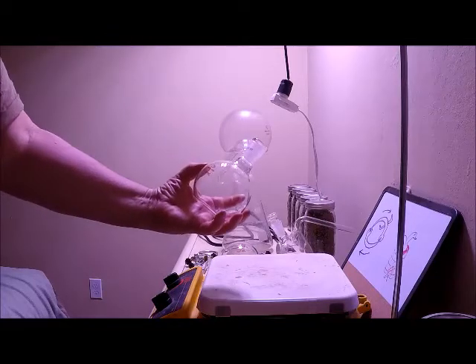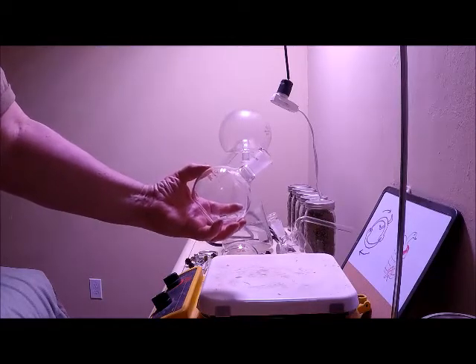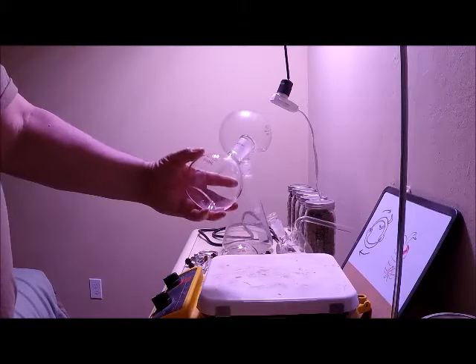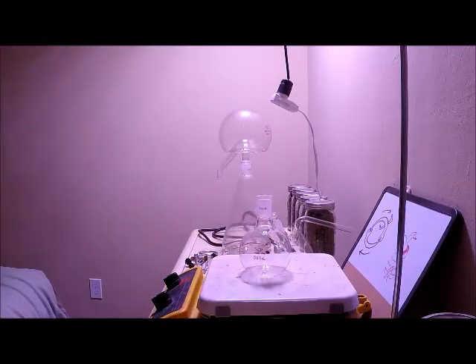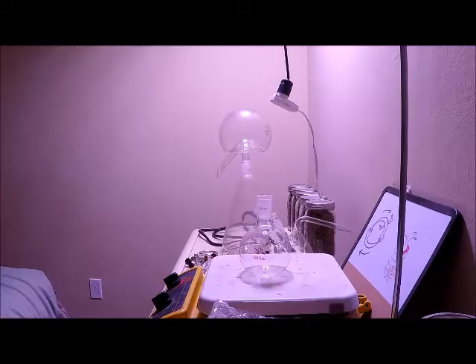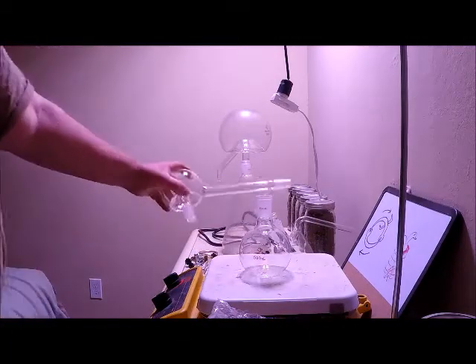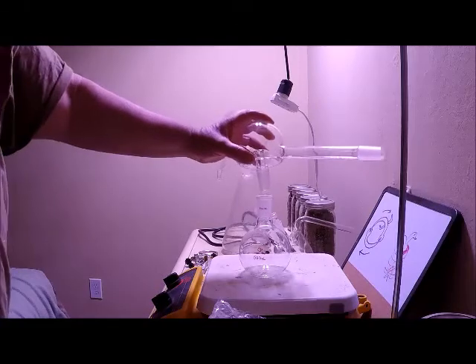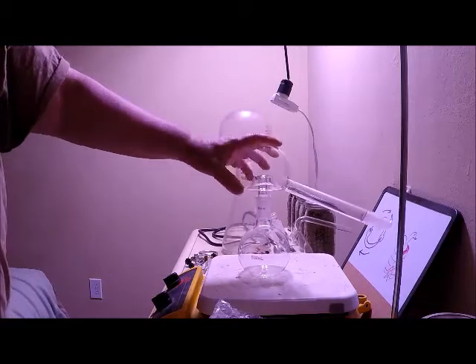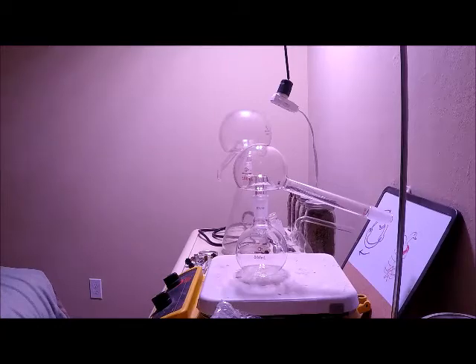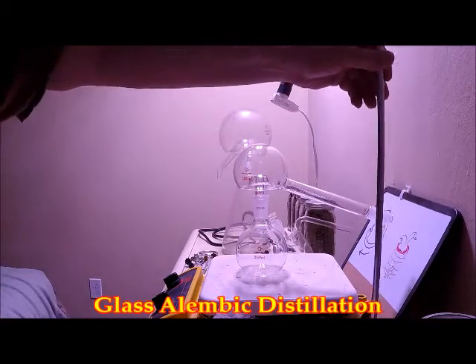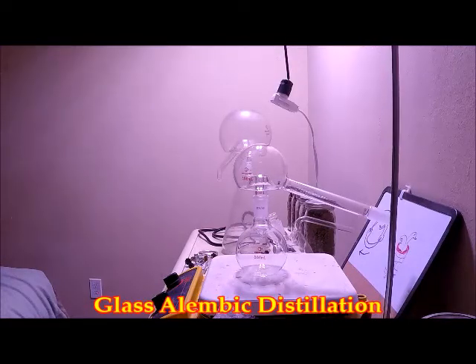There we go. 500 ml flat bottom round flask, 24/40 ground joints. And what goes on to that? My limbic distillation head. Nice. Interesting. And there's the clamp stand in case I need that.